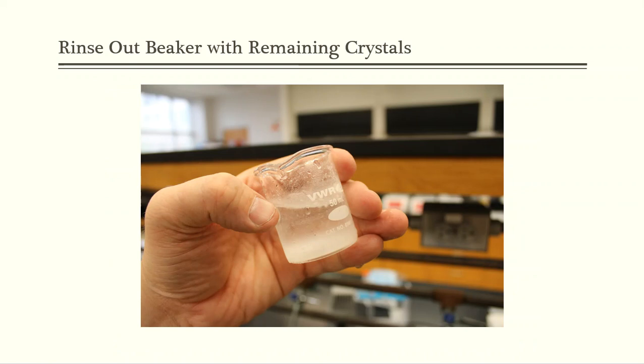All right, guys, so after I pour everything through that filter, I've got this beaker that had all of my crud in it, right? All of the stuff that I needed out. So I don't want, again, to leave any of that behind. So a proper transfer technique is going to have to be included here.